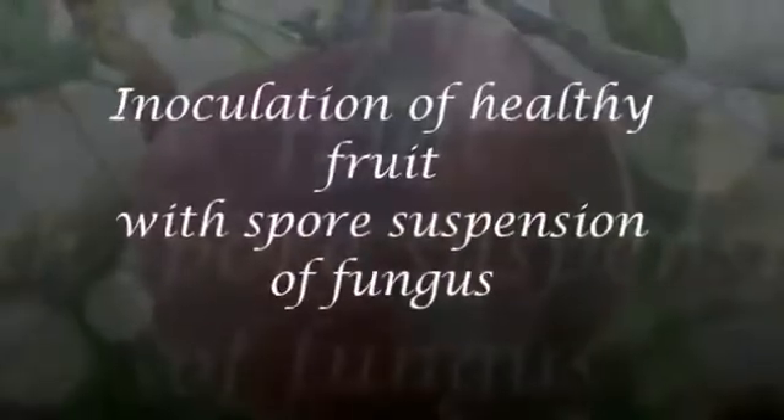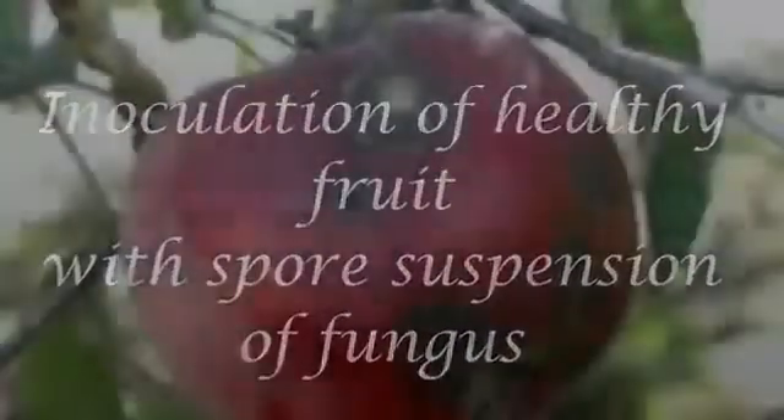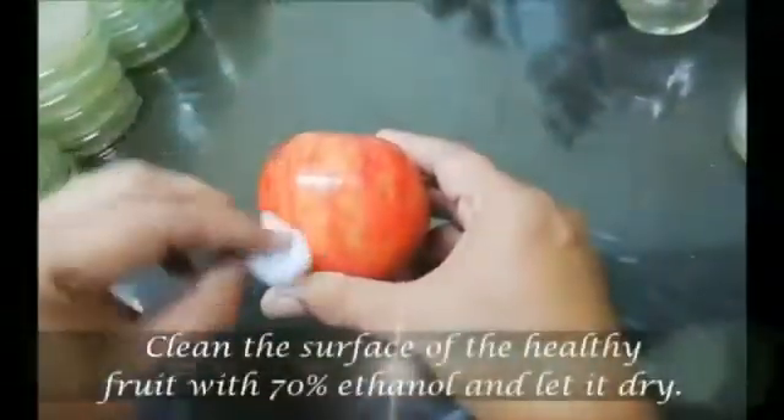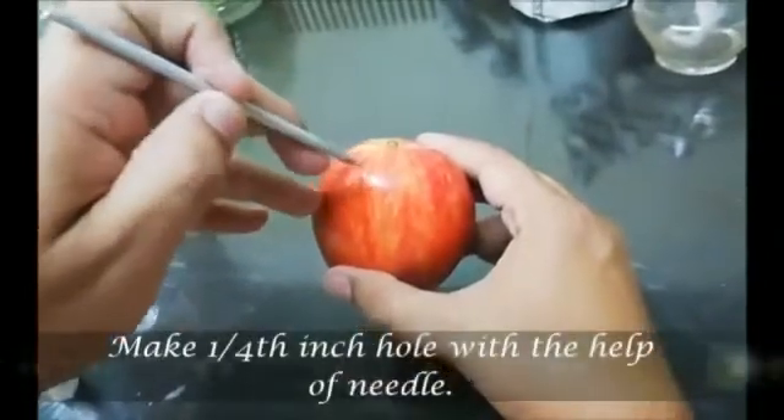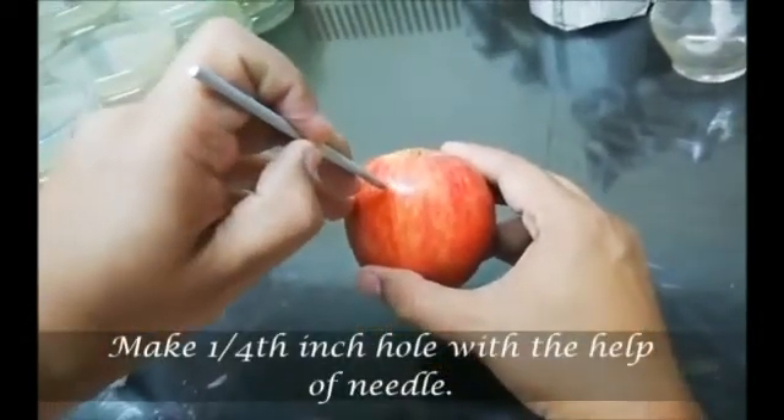Another method is inoculation of healthy fruit with spore suspension of fungus. Clean the surface of the healthy fruit and let it dry. Take a needle and make a quarter-inch hole with the help of it.